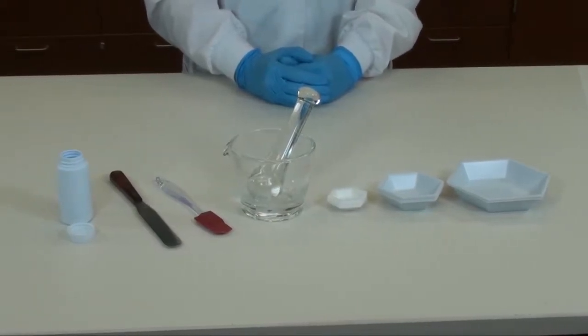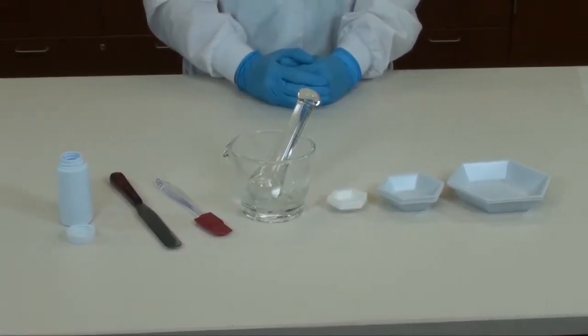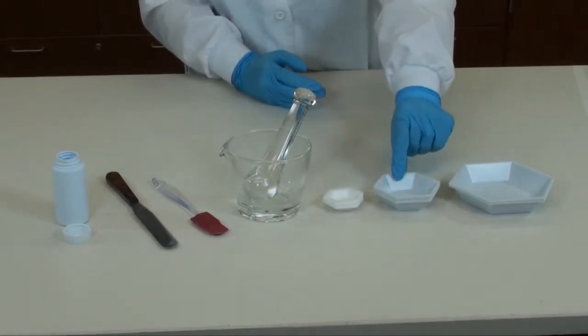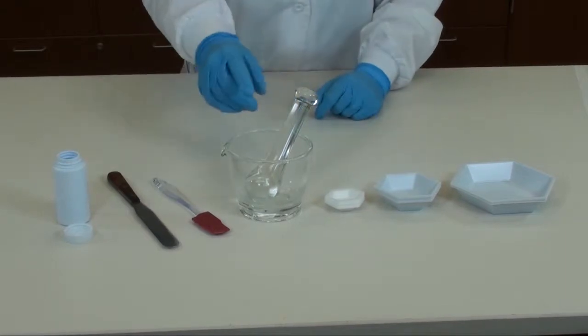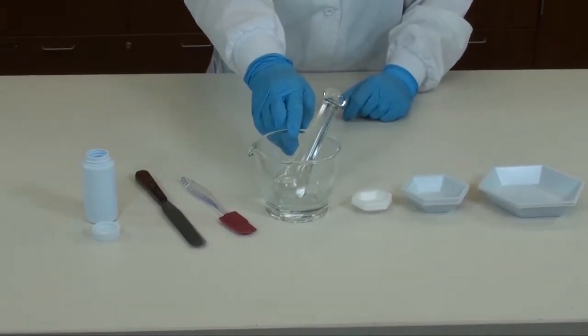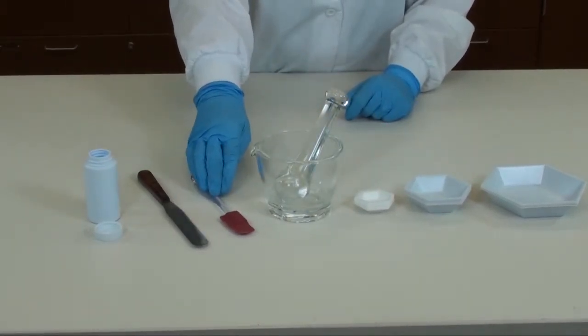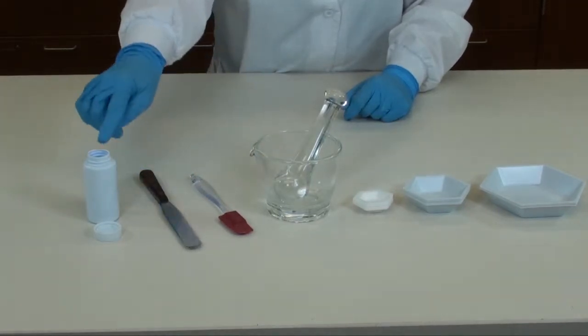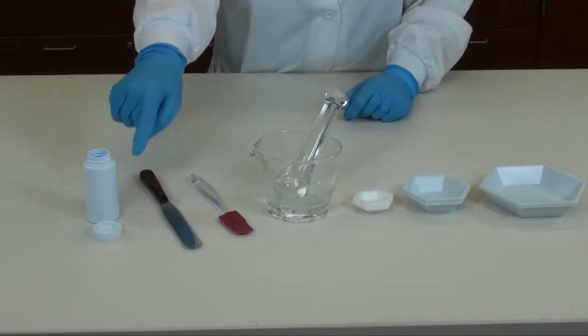The required equipment needed for the wet lab powders: large weigh boats, medium and small weigh boats, a glass mortar and pestle, a rubber spatula, a small metal spatula, and a 3-ounce shaker bottle with lid.